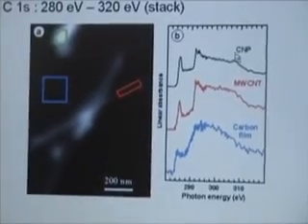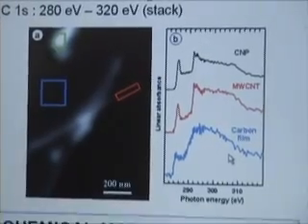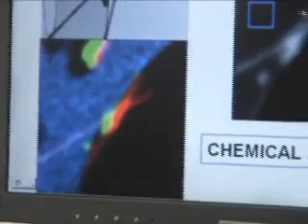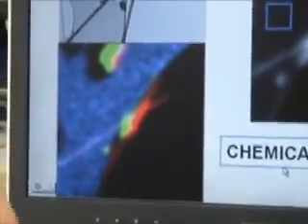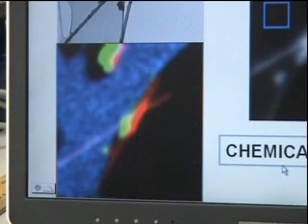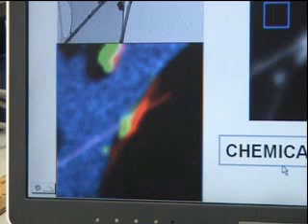These are data that we took last year. After some processing, we were able to build a chemical map, and it was possible to differentiate the signals of the carbon nanotubes from signals coming from other carbon objects present in the sample. Here you can see in blue the signal from the substrate, in green the signals from onion-like particles, and finally in red, these are the carbon nanotubes.